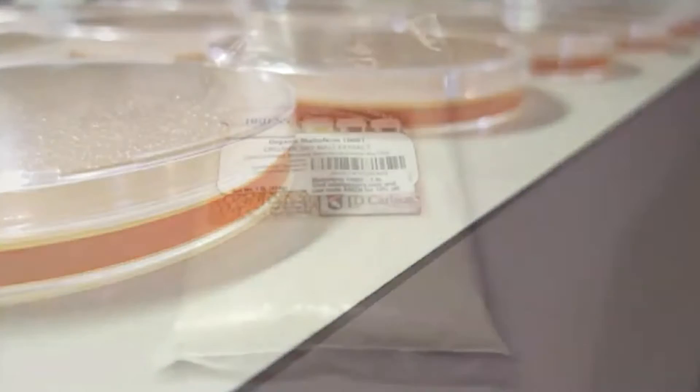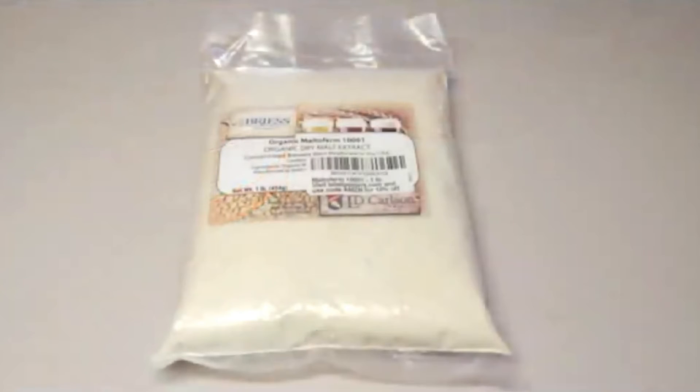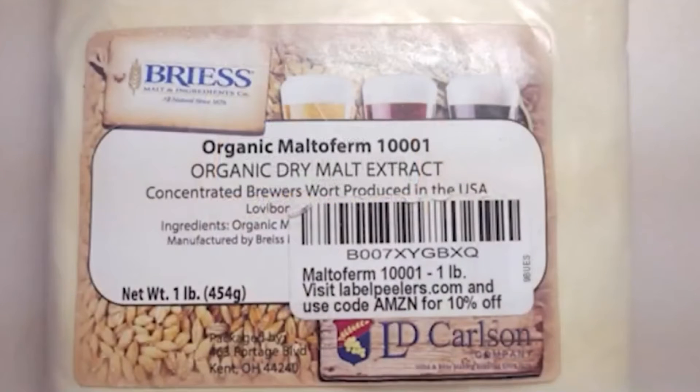There seems to be some confusion around malt extract and light malt extract. There are various malt extracts including light, amber, extra light, pilsen, wheat, rye, and even dark extracts which are used for brewing various styles of beer. All indicators show that any malt extract will work, but it seems that light malt extract is preferred in mycology. The malt extract we use and that is shown in our videos is actually a light malt extract.